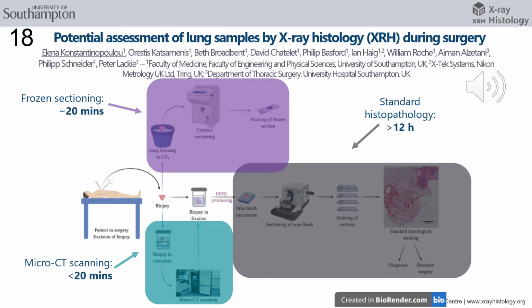It has the added benefit of providing three-dimensional imaging, and it is non-destructive. The 3D scan provides information about the whole volume that would otherwise be lost. We used pig lung for protocol development as it is very similar in size and structure to the human lung.